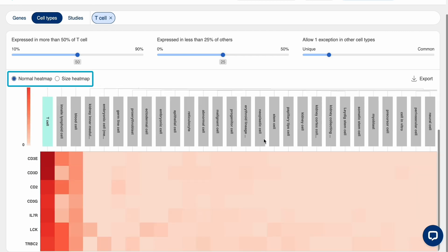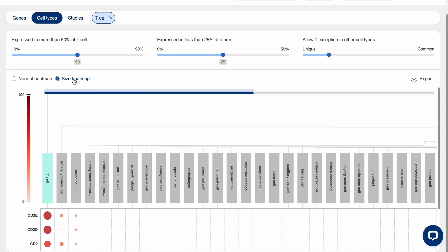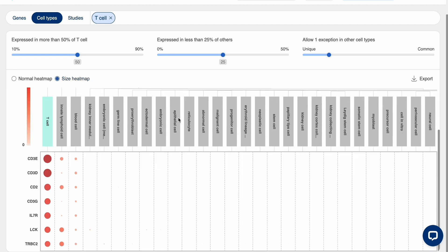You can switch between normal heatmap or bubble heatmap. Export the current image or the data table for later use.